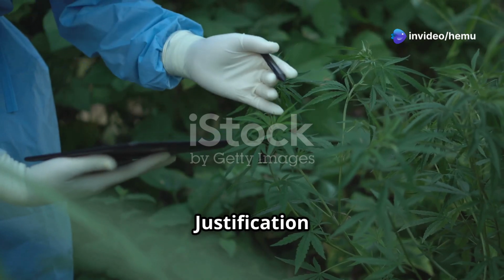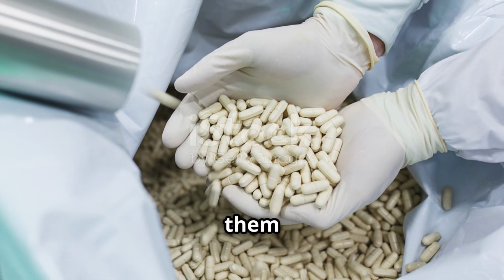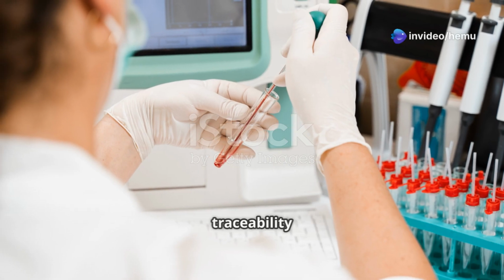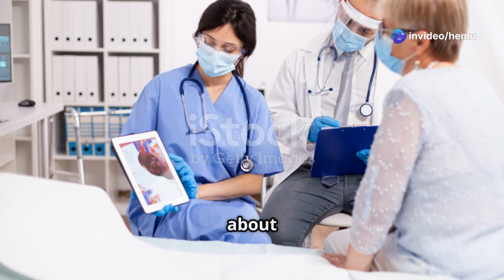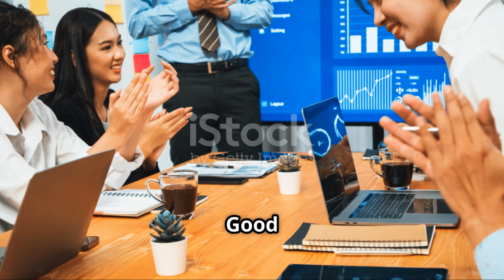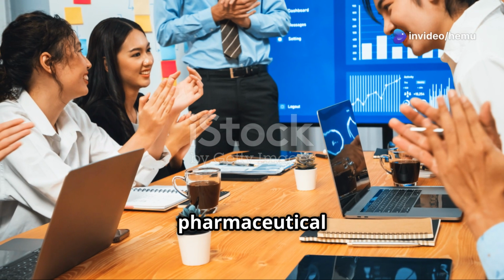Deviations without justification can also cause issues. If changes occur, document them properly with explanations. And lastly, data manipulation. Maintain transparency and traceability to avoid compliance issues. GLP isn't just about following rules, it's about ensuring patient safety and scientific credibility. By implementing good laboratory practices, we contribute to a safer, more reliable pharmaceutical industry.